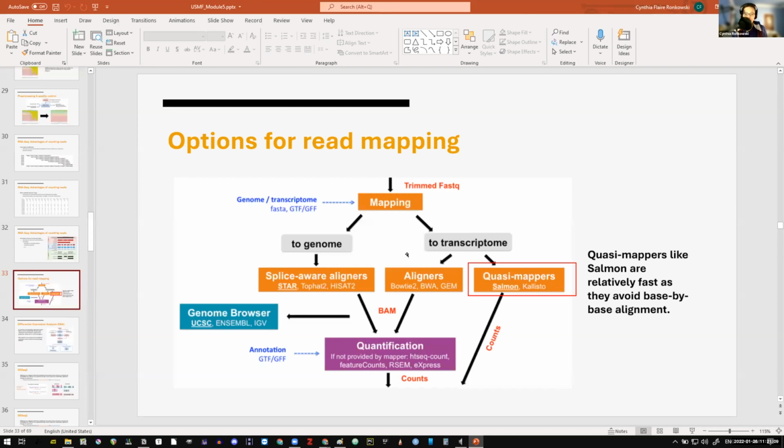it's the simplest way to align to the transcriptome, because if you're aligning to the genome, recall that during alternative splicing, like in the original genome, you have both the exons and the introns. However, if you want to align specifically for differential expression analysis, or rather using Rna-Seq data in general, then you'd want to use what are called splice-aware aligners, which understand that there can be gaps within the alignment.